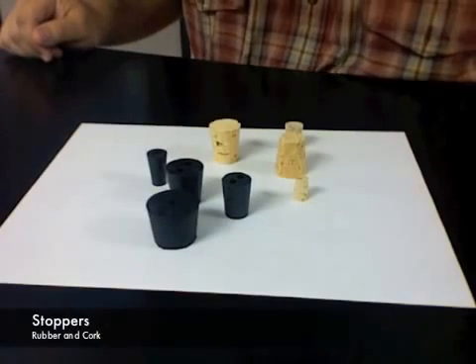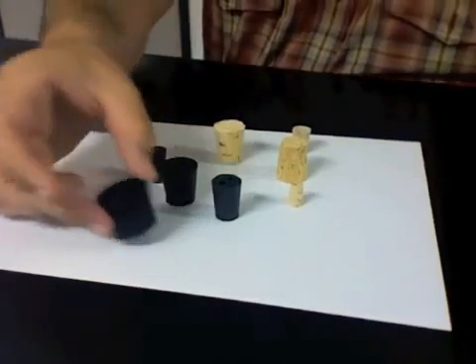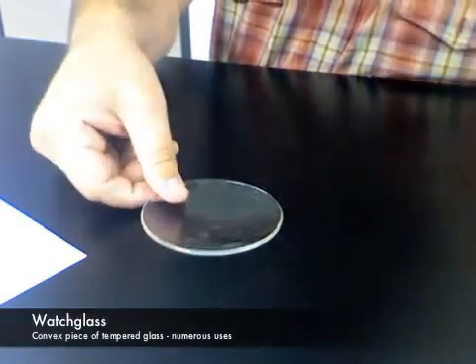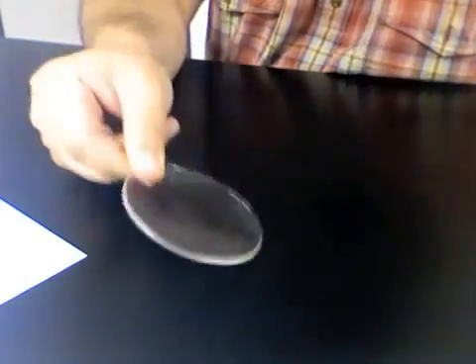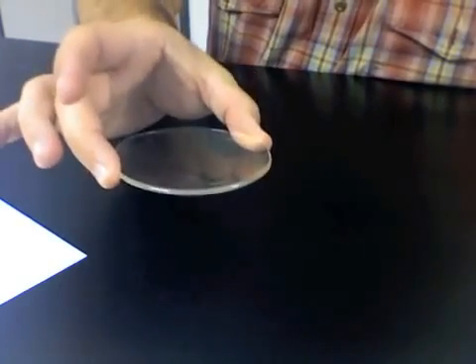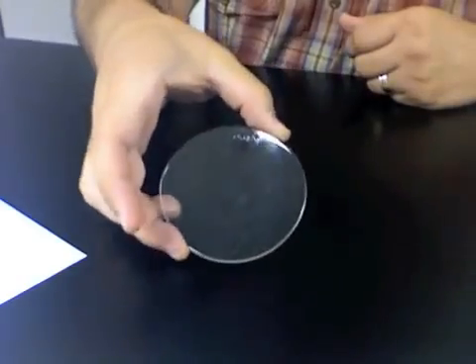Okay, let's look at some of the smaller equipment that's on your list. What you see in front of you are called stoppers. There are two kinds of stoppers. There are rubber stoppers and there are cork stoppers. A watch glass is simply a piece of glass that has a kind of curved back. I think you can see that. And we use that for a number of different things. First of all, we'll lay things in there, but we also will put this on top of an evaporating dish, and the things that are evaporating will collect on the underside of the watch glass. So that is a watch glass.